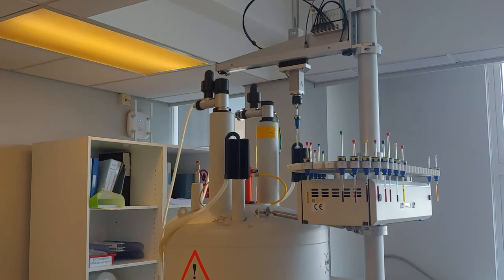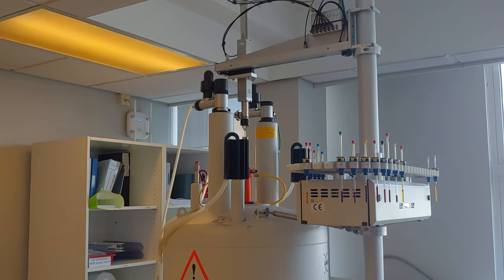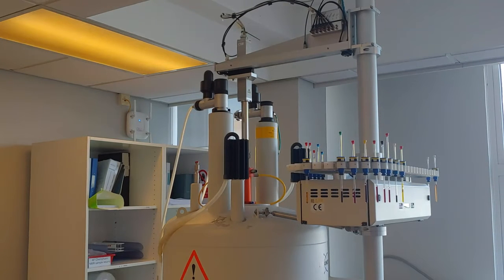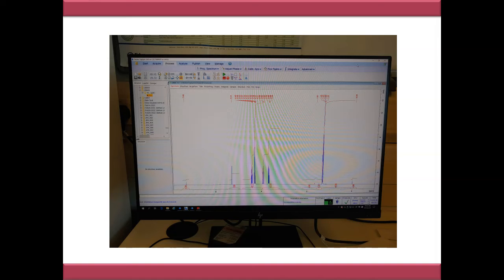It will then move it across to where the borehole is and that's the part in red at the top of the spectrometer and lower it into the borehole where it'll drop down into the center of the magnet to actually run our spectrum. And after a couple of minutes on the computer we'll get our proton NMR spectrum.